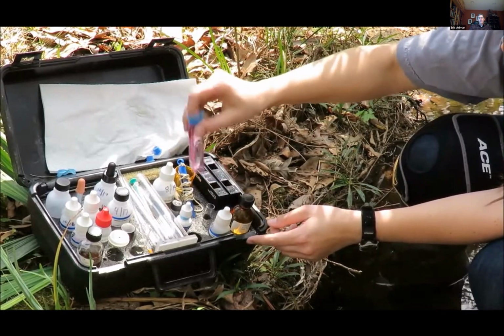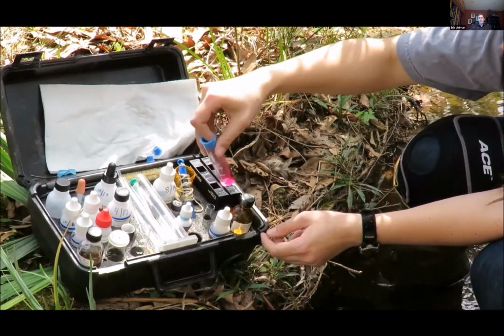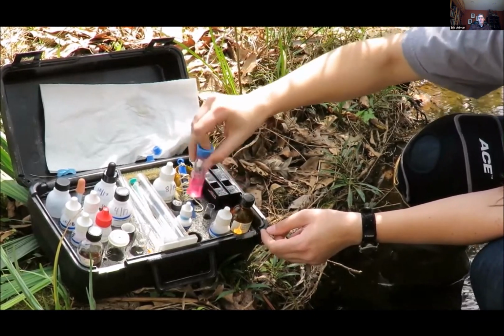A pink color will develop. If a blue color develops, there is no measurable hardness and the value should be recorded as 0 milligrams per liter.